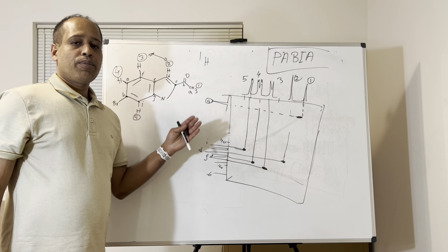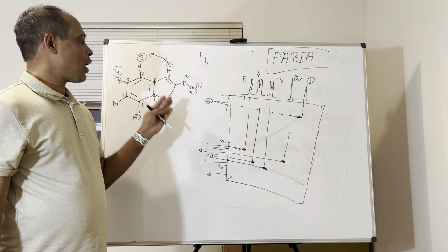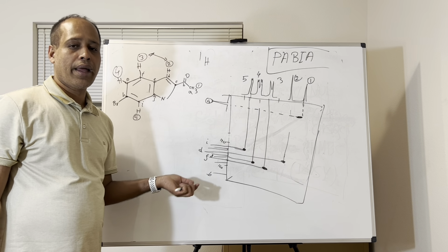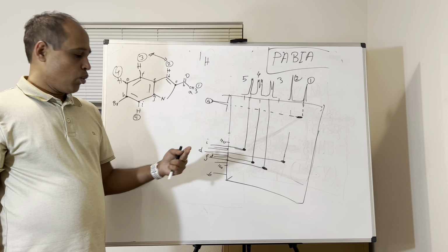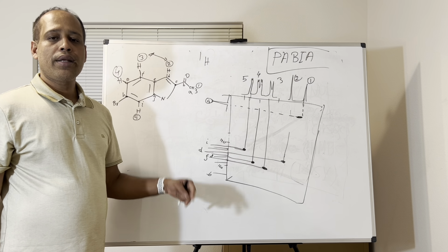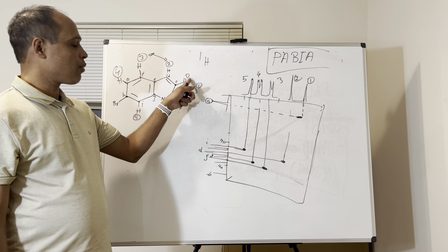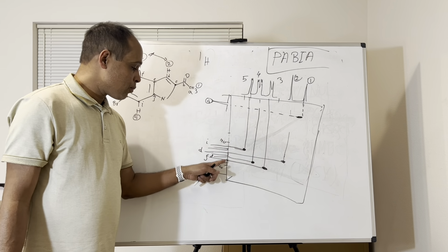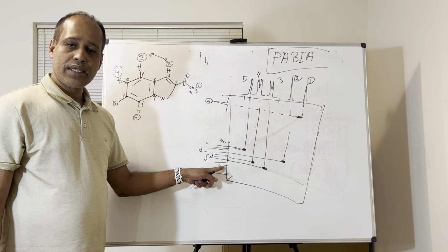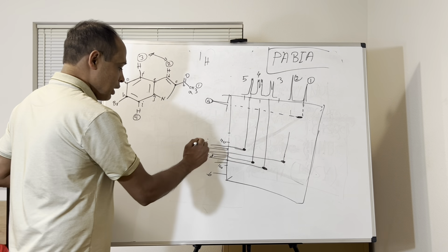So based on the proton connection and carbon connection, you can determine which protons are on which carbon, and the remaining carbons you can identify a different way. Number 1, if you see the carbon is above 165 up to 200, that is definitely a carbonyl carbon. All other carbons from 122 to 160 could be aromatic or double bonded.